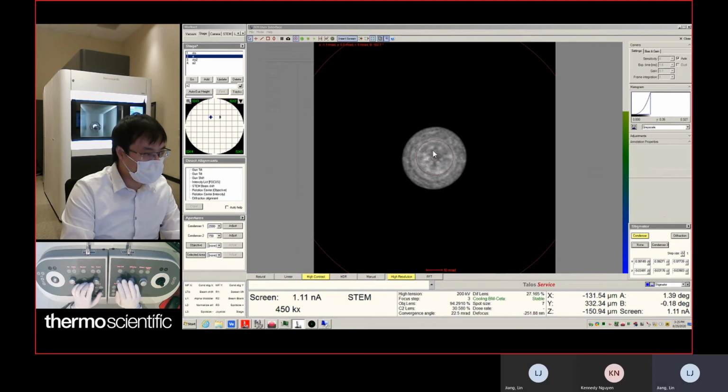You can adjust step size by pushing the coarse and fine buttons. This is the coarse. So you see this is off. This is off. This is closed. Once it's closed, you can push the fine button to decrease step size for fine adjustment.